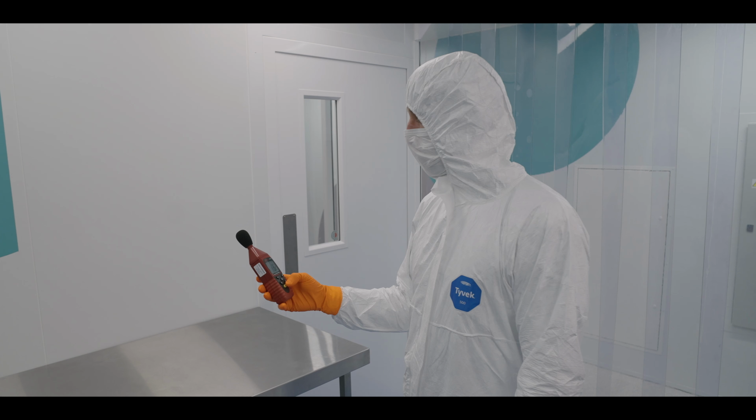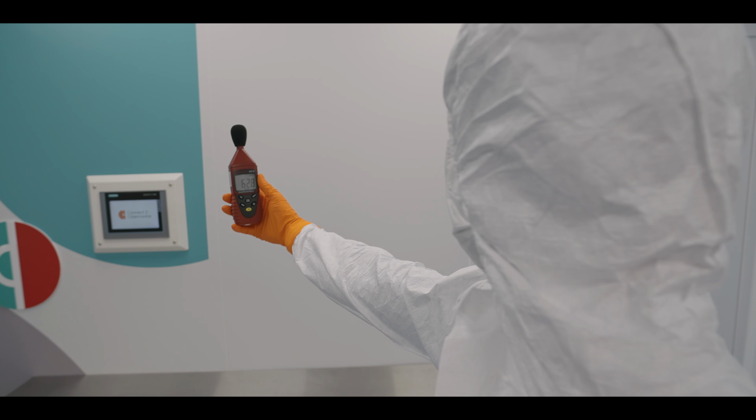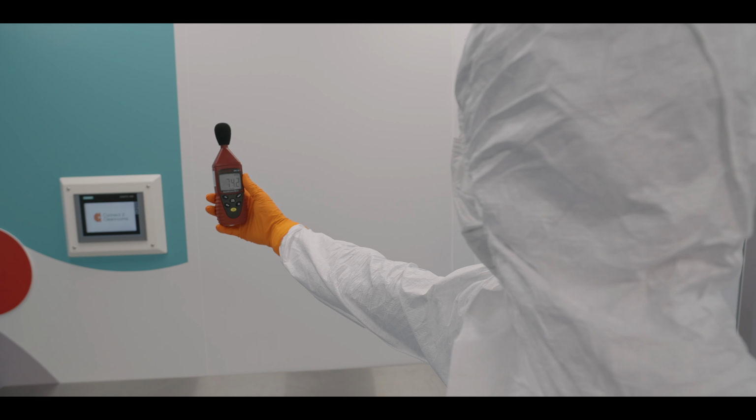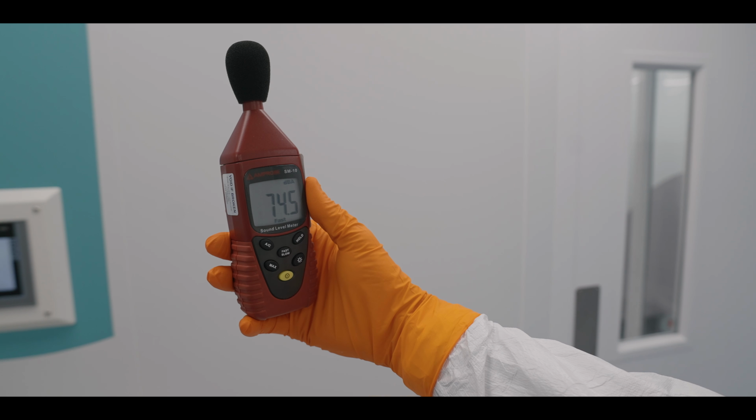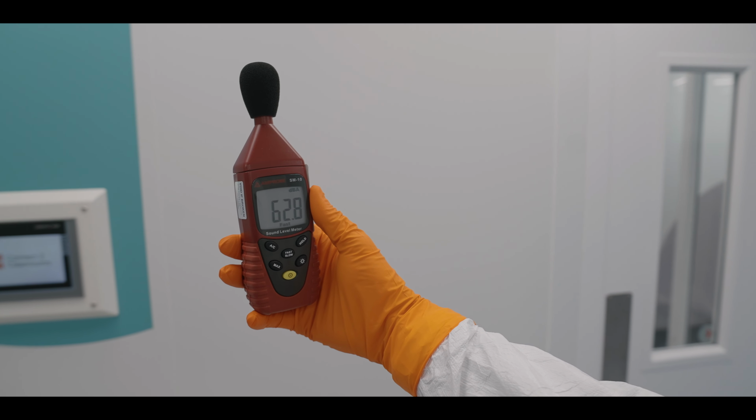In this test we'll be looking at sound readings. Measuring sound levels with a sound level meter is performed as part of a validation. A cleanroom's hard non-porous surfaces and high air change rates make it inherently prone to high noise levels. Maintaining appropriate sound levels is crucial for protecting the health and safety of personnel, improving communication and maintaining product quality.